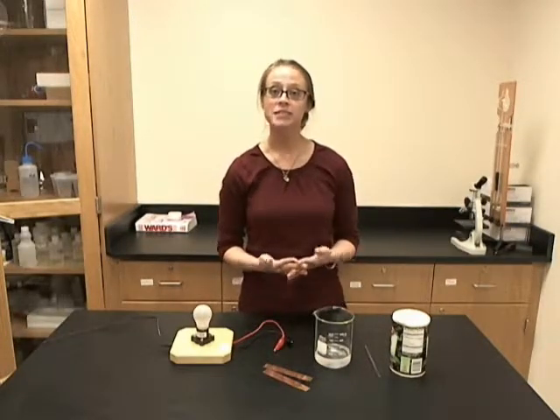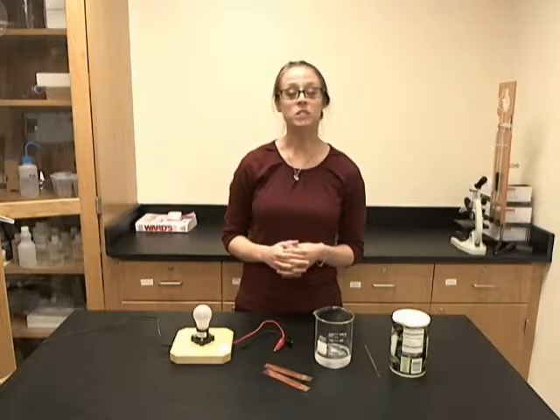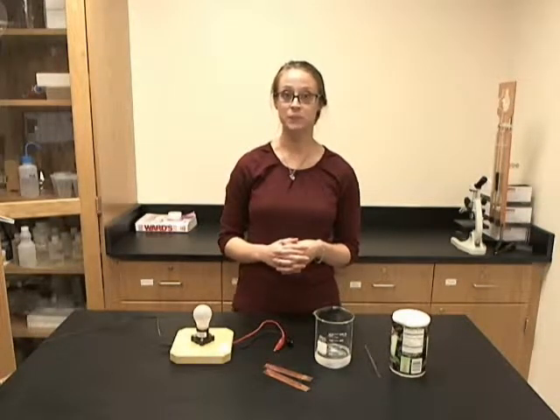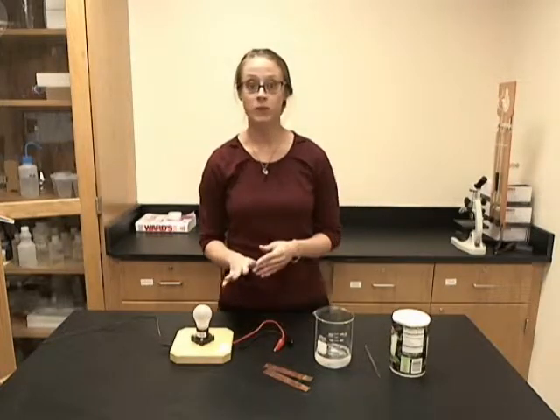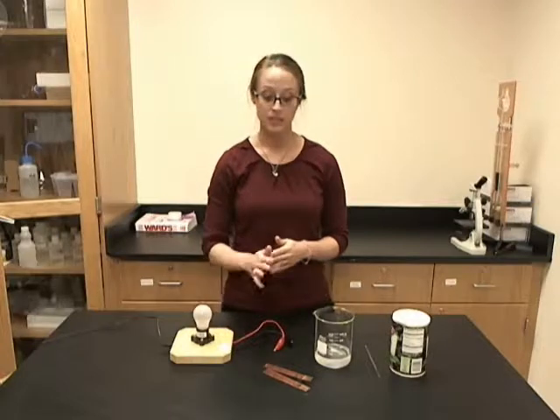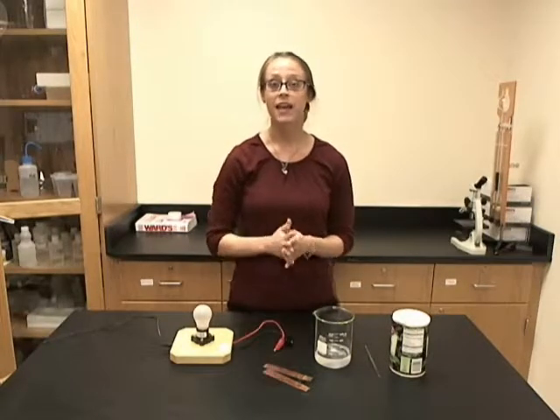I will be doing this with our conductivity indicator kit, which is item 6382800. This kit comes with the conductivity indicator with alligator clips, the copper electrodes, and instructions.